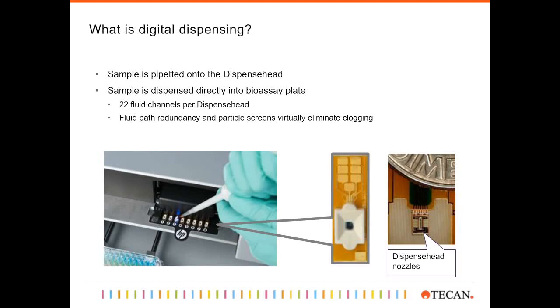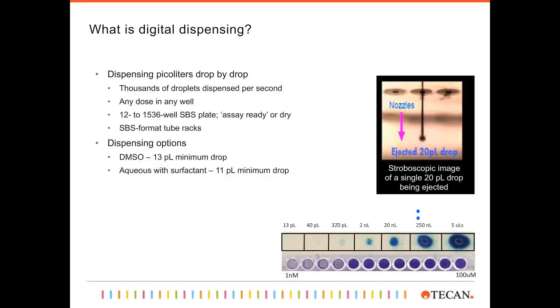Here you just see an enlargement of a dispense head. In this tiny little cup you put your fluid in, and then this is the bottom view, and from these non-visible dispense head nozzles, the fluid is dispensed into the plate underneath, as you can see. On the next slide, you can see an enlarged view of the dispense nozzles, and a tiny drop just dispensed from the dispense head.